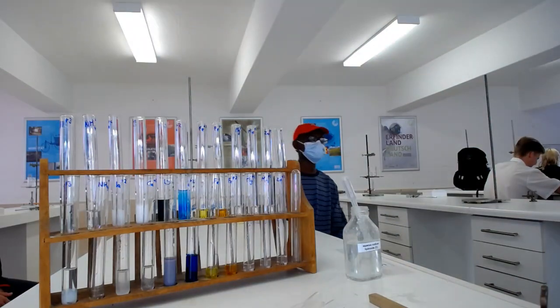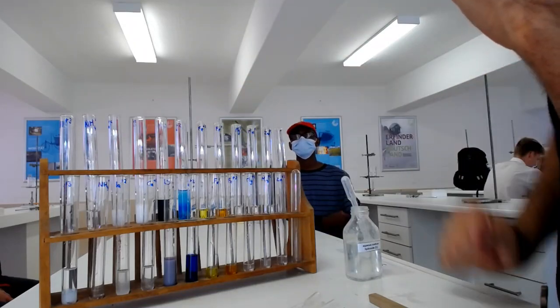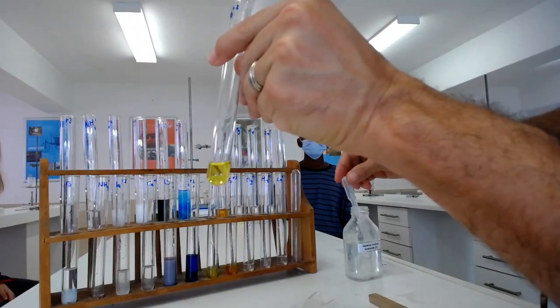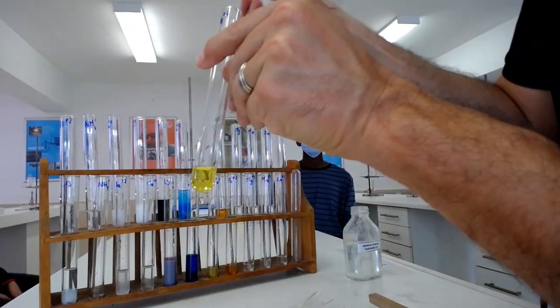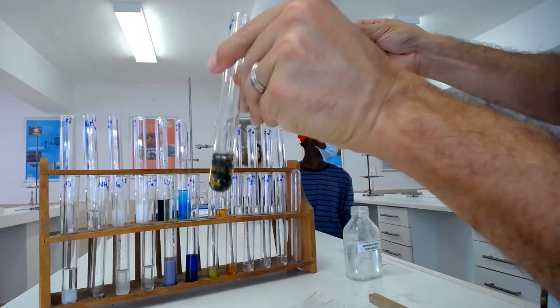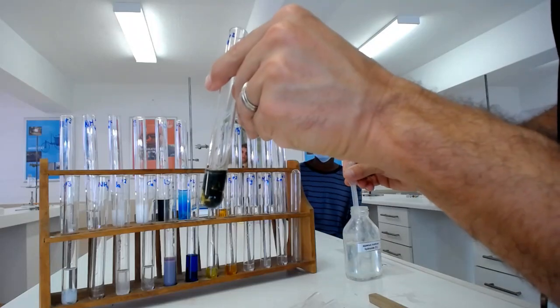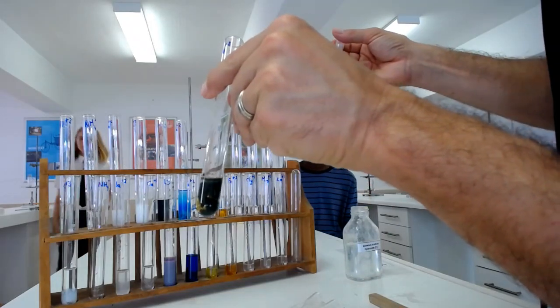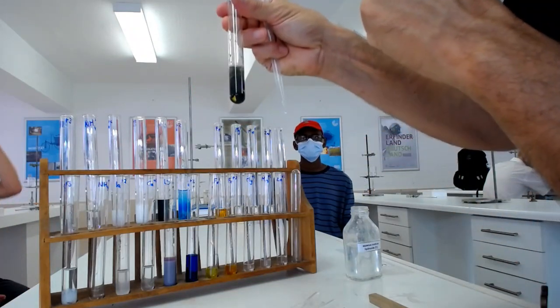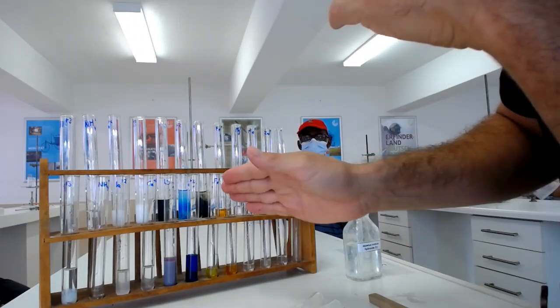The favorite one to ask is the iron 2 and iron 3. Let's see. Iron 2 with your sodium hydroxide, what happens? It's a green precipitate. Ooh, look at that. That's cool. All right, what happens if I add it in excess? Insoluble, so it stays that way. Okay, so there's my green precipitate in the bit of yellowish liquid. Okay, fine. I'm going to leave it there.